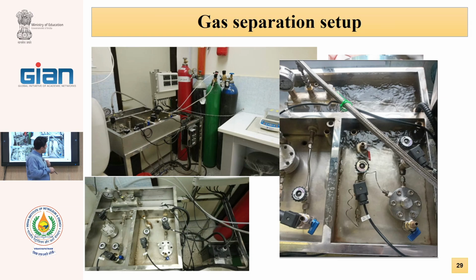We have this system. In this system, we have a very little dish, usually 1 gram of polymer we put in this dish and locate in this system in contact with the gases. For example, very low pressure gases, for example, this, right?